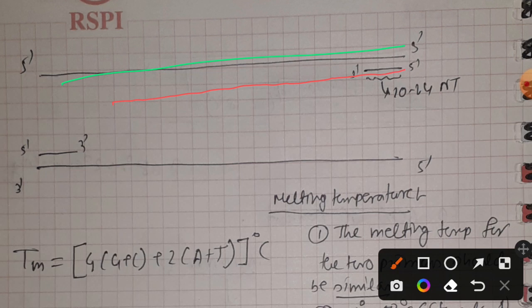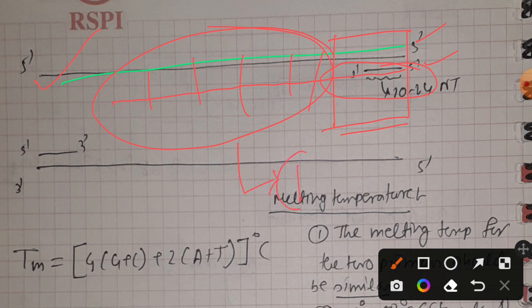Now the primer finds complementarity with that part, so they will anneal, despite these two parts not being fully complementary, and that will not create any problem. We discussed this earlier during site directed mutagenesis, where we used a wrong primer intentionally, but still they annealed. A similar situation can apply here also. That is why too long primers are not recommended, because they can promote mismatch priming, mismatch hybridization.